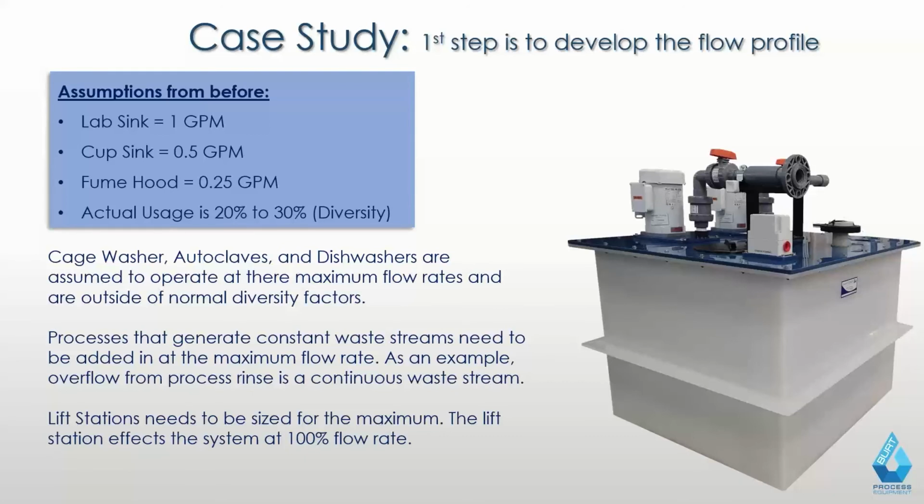Keep the pH system as one unit and simply have a larger lift station down there to basically transfer the entire facility waste up. But you can put just the treatment tanks in a vault and then allow everything else to basically sit above that pit. And just bear in mind that when you do have to go in there, it's going to be a confined space at that point. So that does come up quite a bit actually in pH system design.